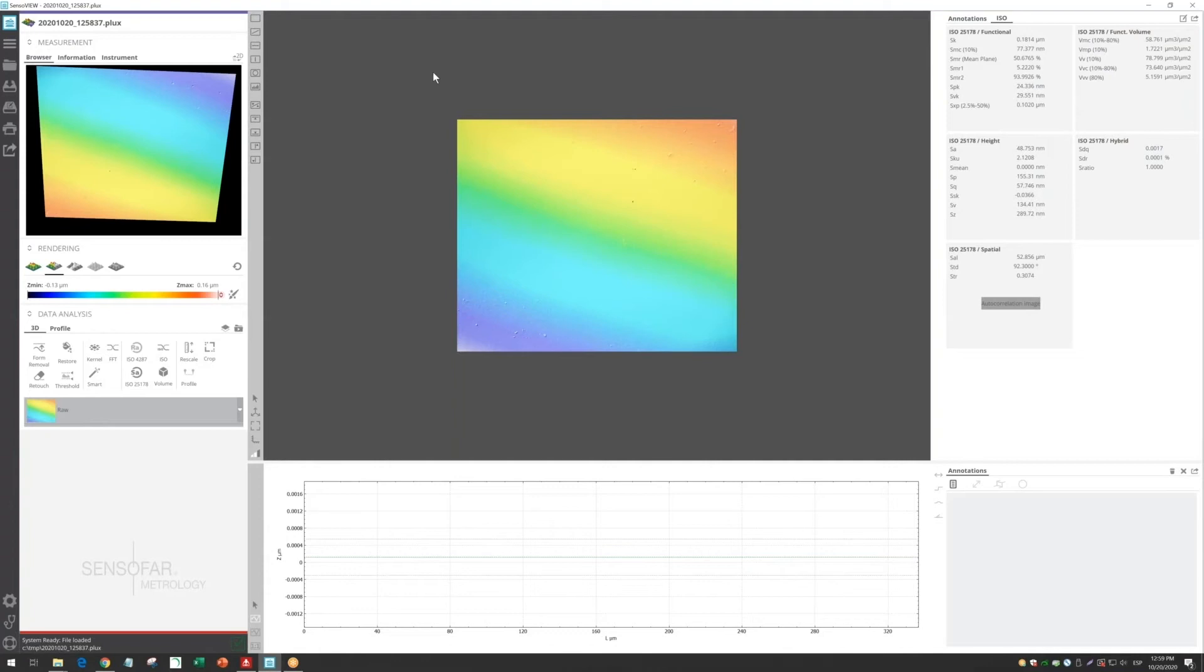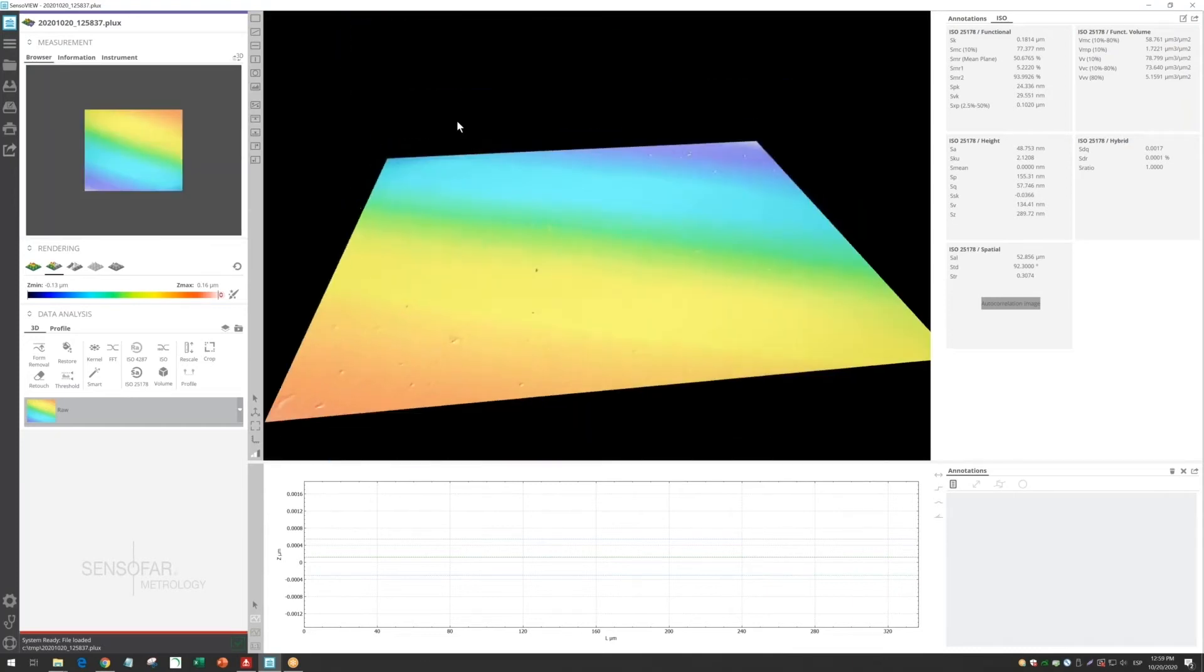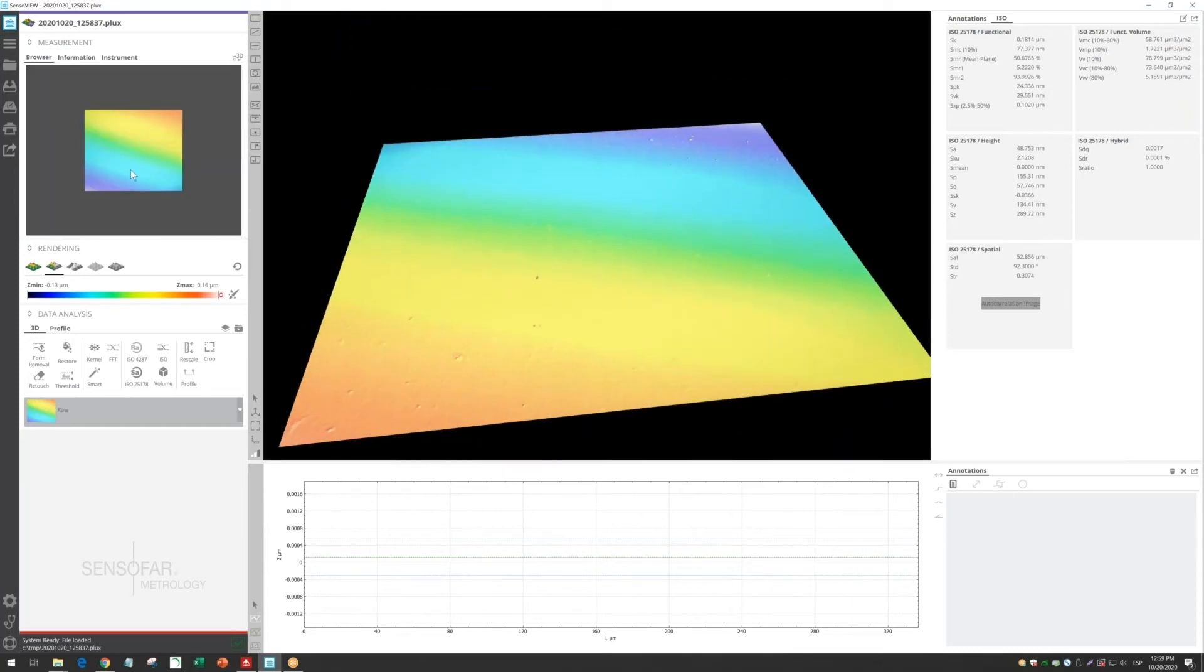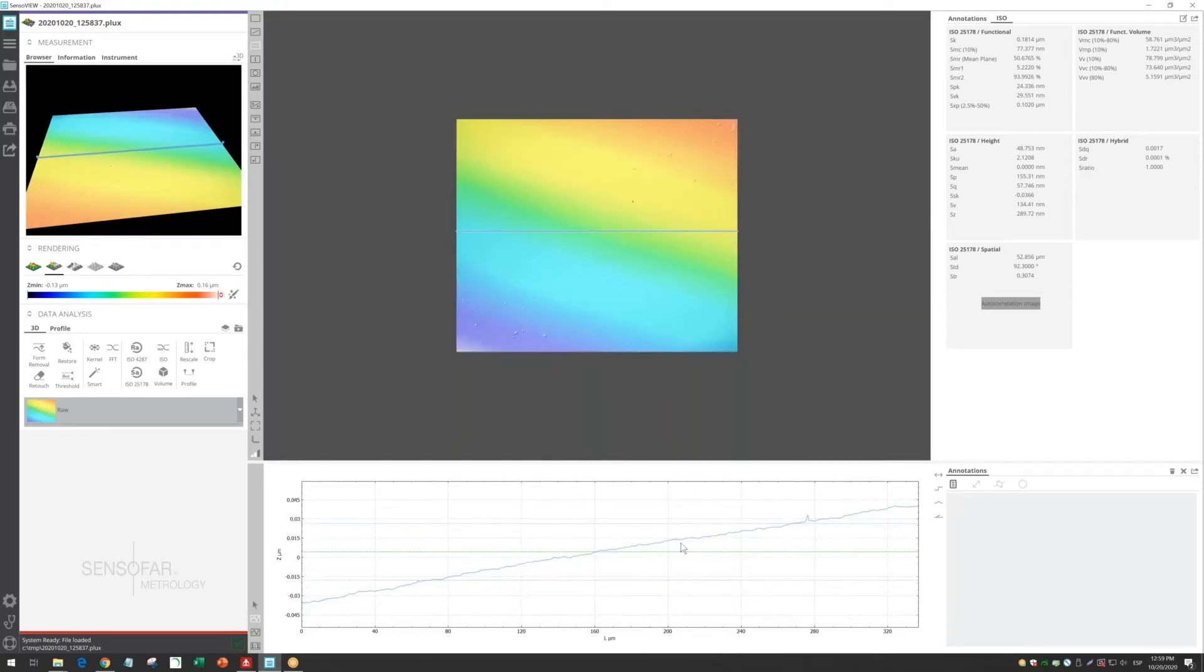When the precision scan is finished, it automatically opens the analysis software, where we can have a 3D view and the contour view. We can take a profile here, and we can see it's slightly tilted.